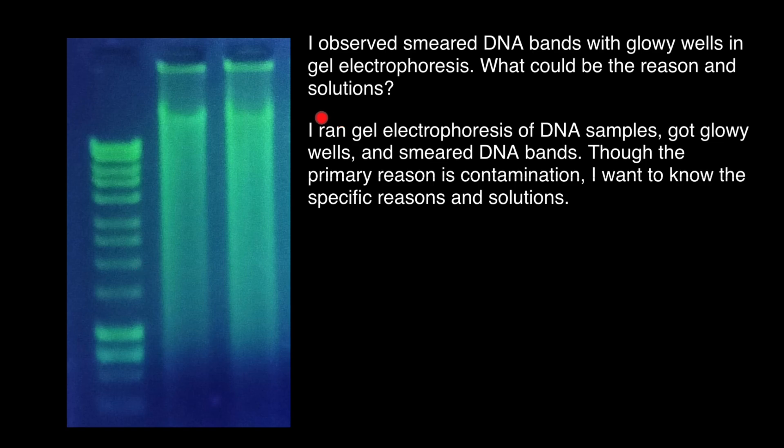Here is the additional information around the gel electrophoresis of DNA samples: gel wells and smeared DNA bands. Though the primary reason is contamination, they want to know the specific reasons and solutions.